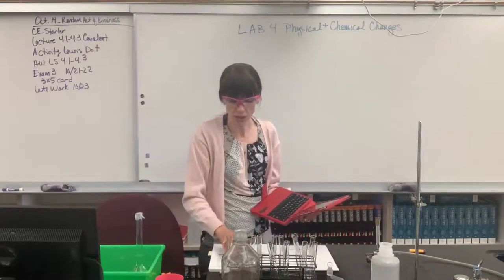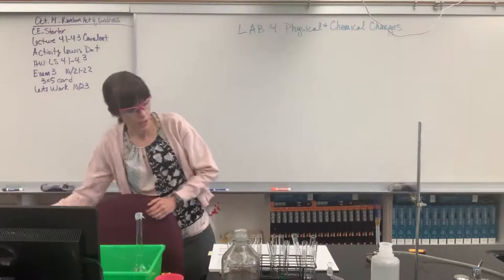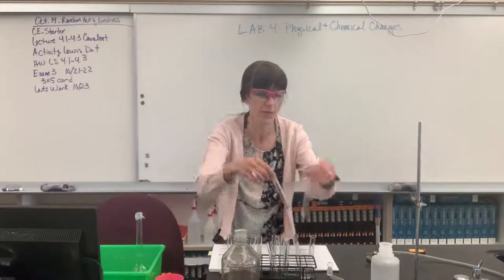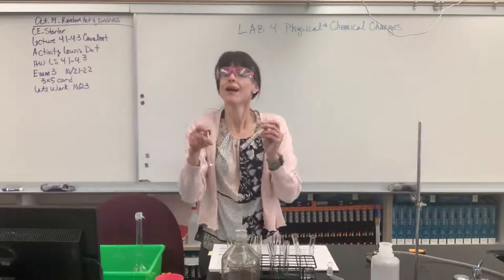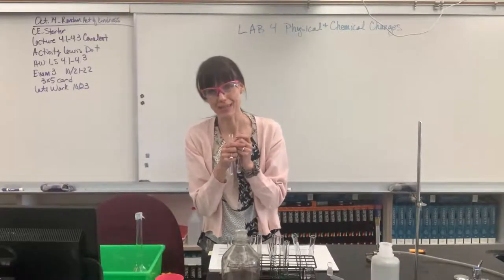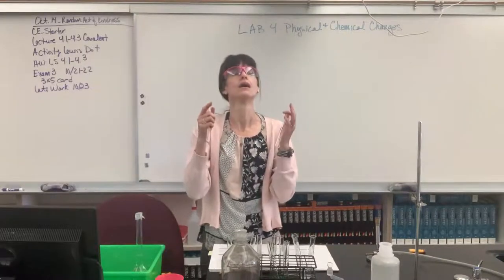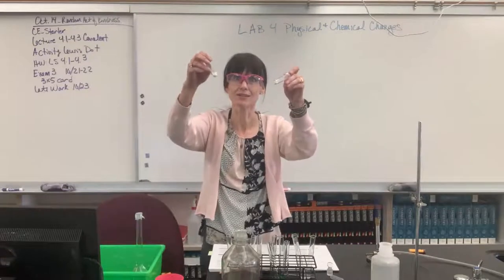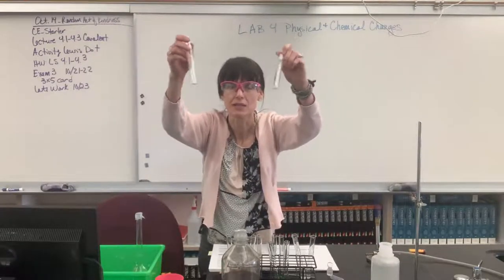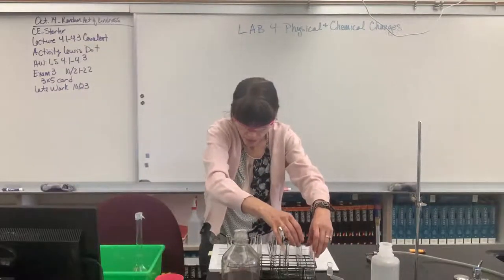it says place approximately 0.1 gram of solid sodium bicarbonate into two dry test tubes. So let me show you. Here I've got it. White powder. A little FYI, sodium hydrogen carbonate, bicarbonate, is just baking soda. What you'd use if you're making cookies or something like that, just a white powder. I weighed out 0.1 grams of each of those.